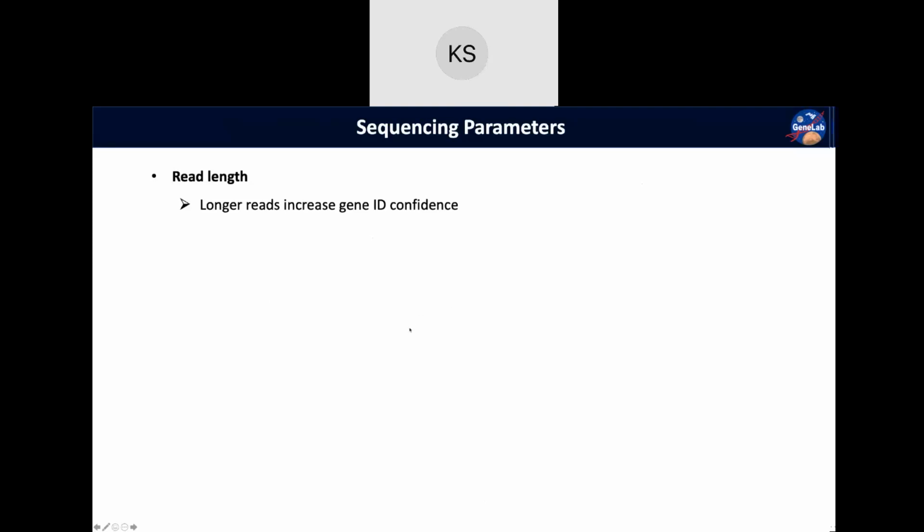And so we really want to get the longer reads, the better, but of course we want to maintain high quality. One of the caveats of sequencing by synthesis is that the polymerase gets tired, because we really haven't optimized the conditions as beautifully as they are inside of our cells to allow the polymerase to sequence forever. The optimization, like I said, Illumina's longest reads are about 500 cycles total, so you could do paired end 250. More common paired end 150 is our standard.